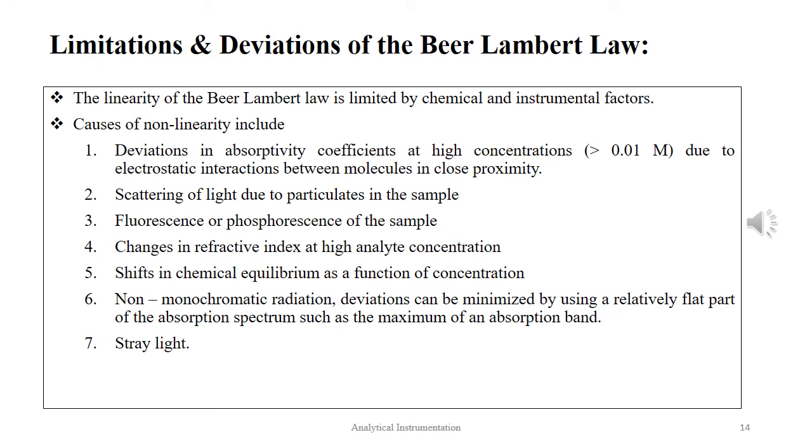Deviations can be minimized by using a relatively flat part of the absorption spectrum, such as the maximum of the absorption band, and no stray light.